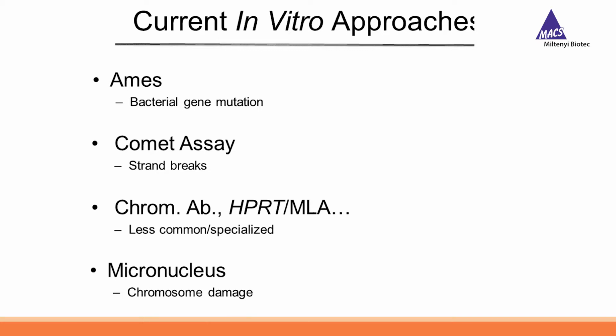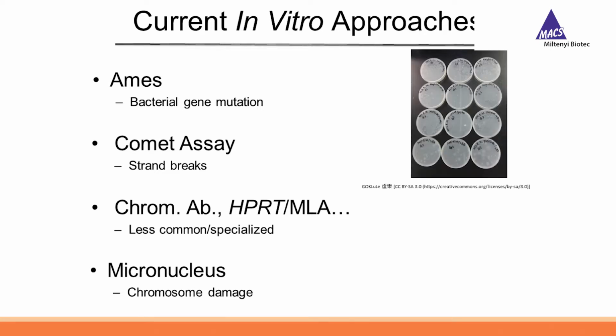I'm going to go over a couple of the current in vitro approaches. This looks back at the slide that Jakob showed a little bit earlier, talking about the different batteries for regulatory genotoxicity testing. These are some of the specific tests that make up those batteries, and I'm talking specifically about the in vitro approaches here.